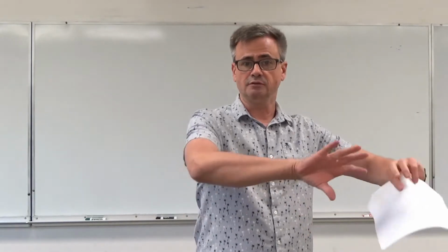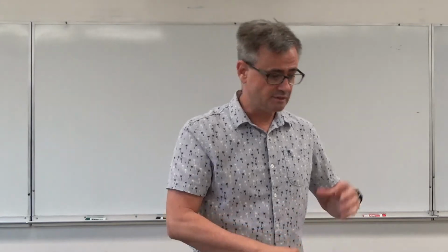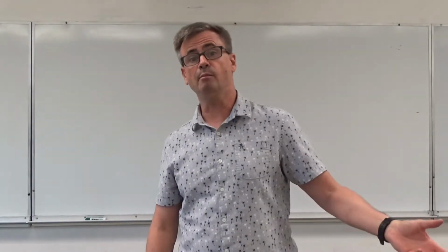We'll talk today about how we monitor the rate for the reaction that we're doing. Then you hold one of them constant, because you don't want to change both at the same time or you haven't learned anything, and change the other one. Say you double it.